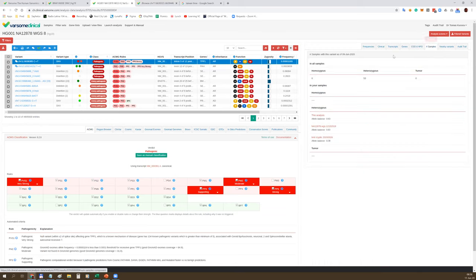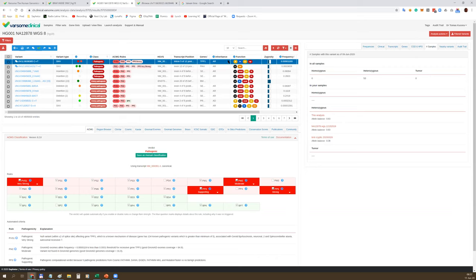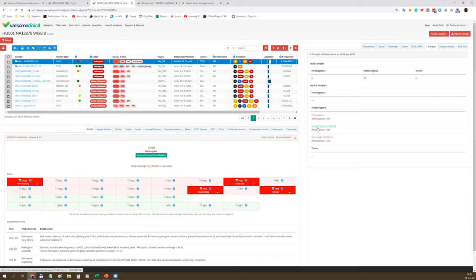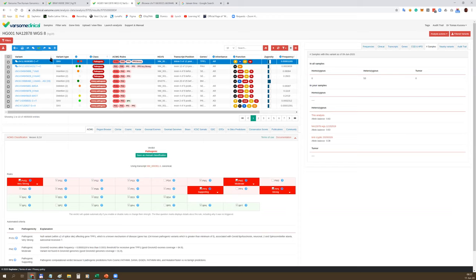You may reclassify it as a variant of uncertain significance, for example. Or you can set up fully custom classifications such as 'variant important from a pharmacogenomics perspective' or 'variant which needs to be discussed later.' These custom classifications or reclassifications stay with the variant forever unless you change it or remove it, which means whenever you upload a new sample with the same variant, you will see the same classification. This allows you to create, over time, your private database of classifications.